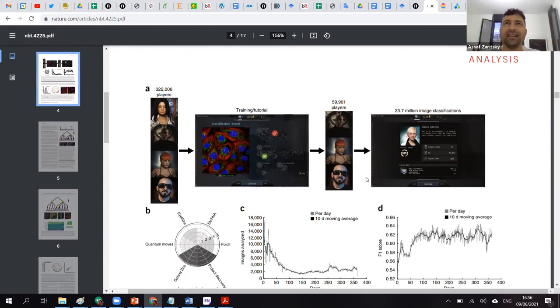The data set here could be useful for a course project if anyone is interested in the Human Protein Atlas. Usually you have a cell and a landmark, so like a couple of organelles, I think the nucleus, maybe the membrane, which are common to all of the images. And then you have a target protein, and you want to do the classification task: classify where this protein is located, on what organelles the protein is located, okay?